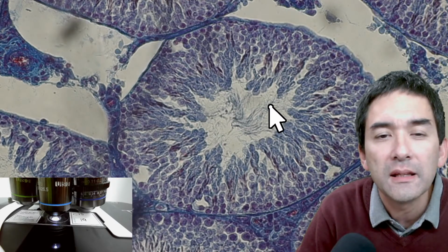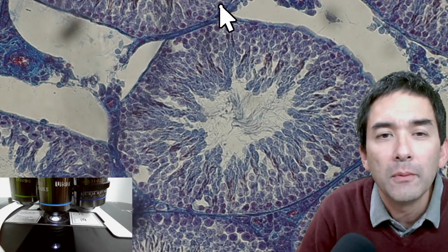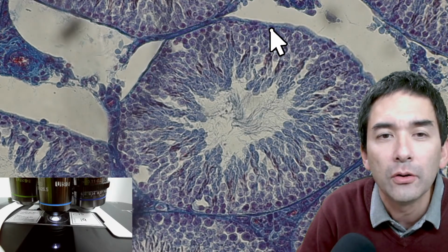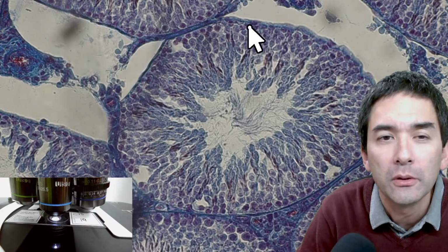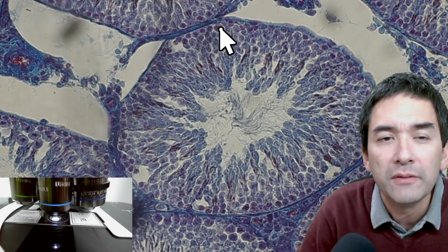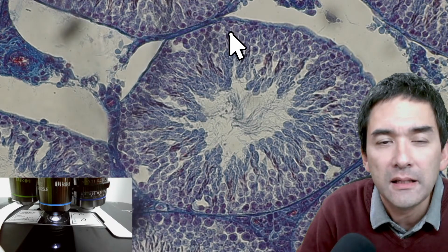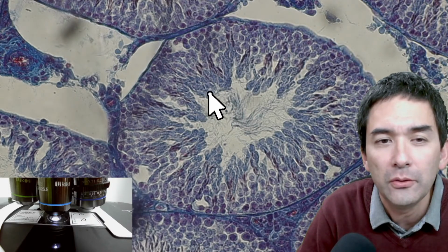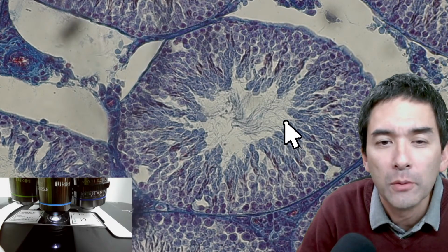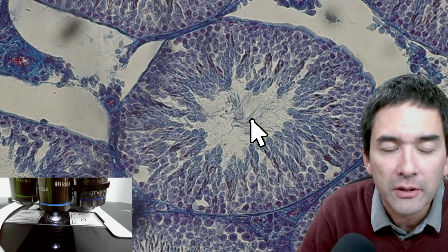Here you see those. Do you see the lines here? Okay, these are the tails of the sperm cells. On the outside here we have what is called the basement membrane, and then there is a layer of cells right beneath it called the germinal epithelium. I think you don't have to know the terms here, I'm just saying it. Yeah? And these cells over here, they start to divide. They undergo cell division. And as they divide, the cells move inwards until you have the finished sperm cells in here. And then the sperm cells detach and are carried away.